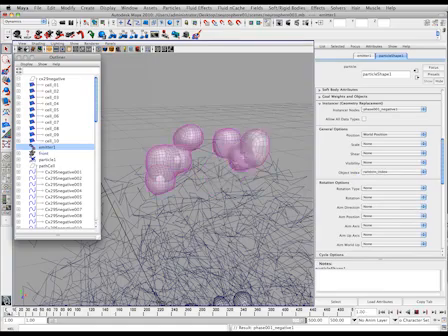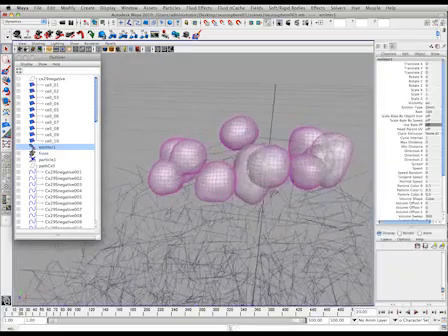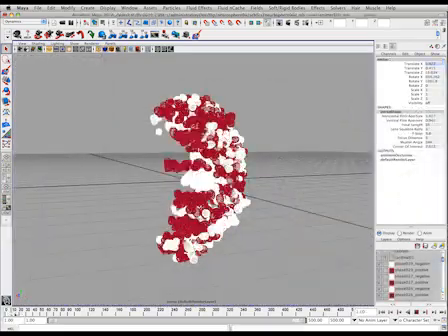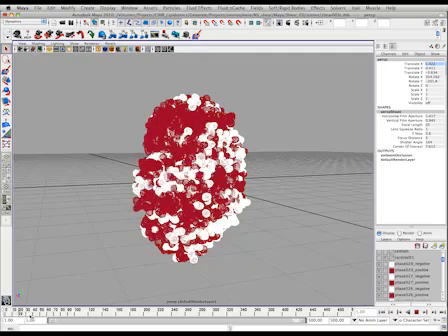Bring the time slider to the first frame and hit play. The cell types are now randomly distributed among the particles. Repeat this process for each section of the neurosphere. Ensure that each new emitter, instancer, and random index is differentiated by name and organized appropriately in the Outliner window.